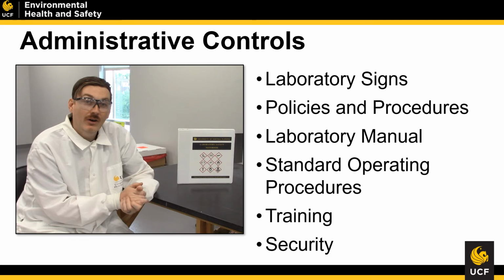Within the laboratory manual, you'll keep your inspections and your standard operating procedures. As scientists, we develop good laboratory practices by being able to create repetitive and reproducible results. SOPs are one way that we're able to do that. If we can write down what we want to do and we are able to repeat the written work, then we're able to pass that work on for verification. I would encourage you to have an SOP for everything that you do within a laboratory. So if there isn't one, talk with your primary investigator or supervisor and see if you can write one. That'll be a good technical writing experience for you.